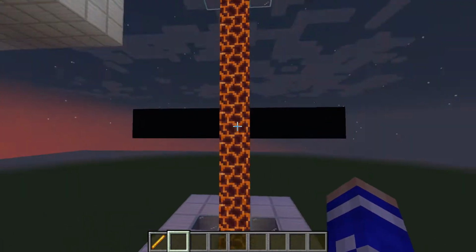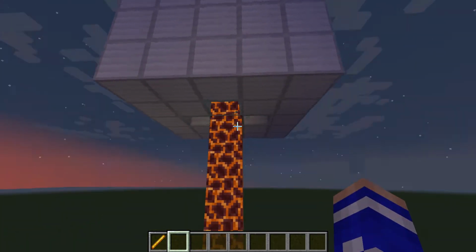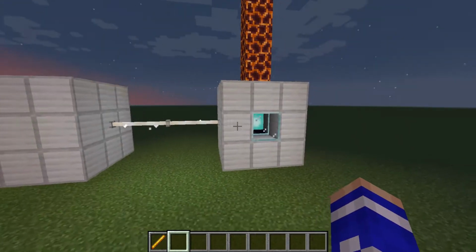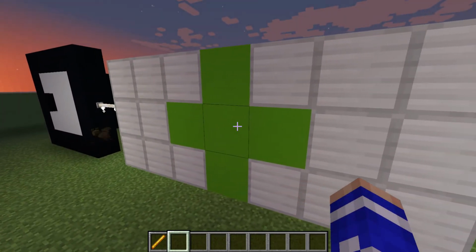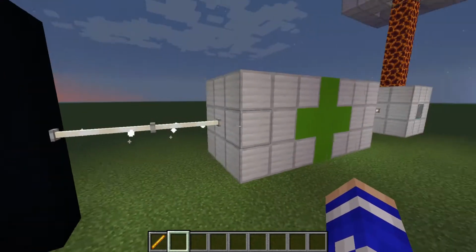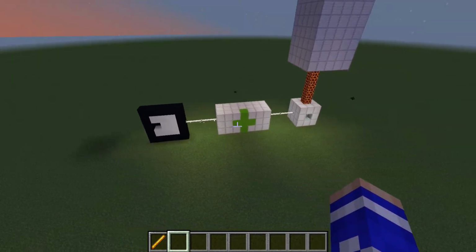That will pass through another slit and into our emission monochromator. And this emission monochromator will break down the wavelengths into the ones we want to analyze. And that will go into another detector, a photomultiplier tube. That signal is going to first go into a current voltage amplifier so that we have more of a readout to look at, and that is going to go into our screen and our readout where we can analyze the results.